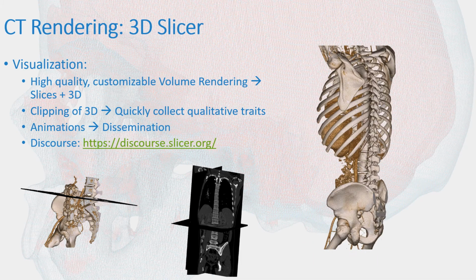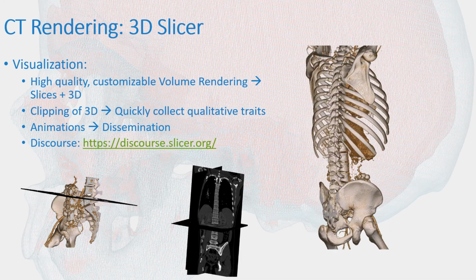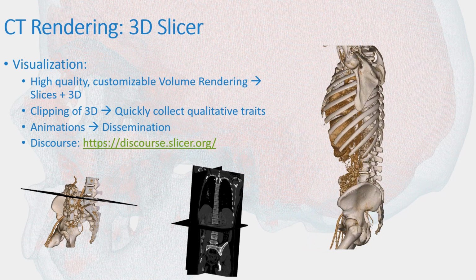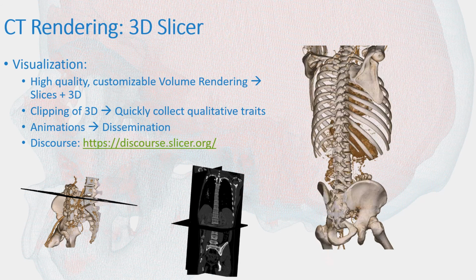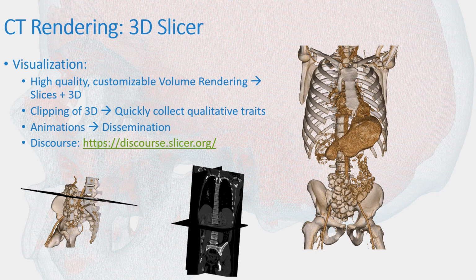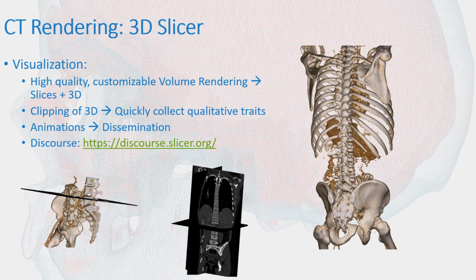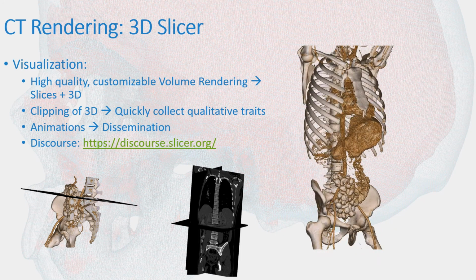The Slicer Morph extension has added tools to support microCT processing, including a direct link to MorphoSource. Interested users are encouraged to visit the Slicer discourse to keep up with updates and seek support.